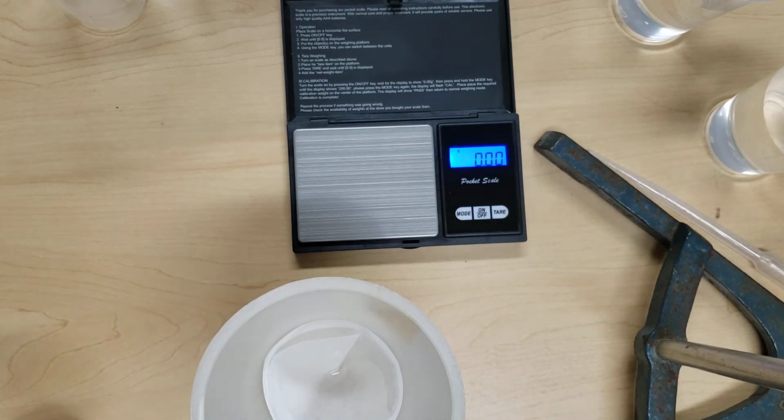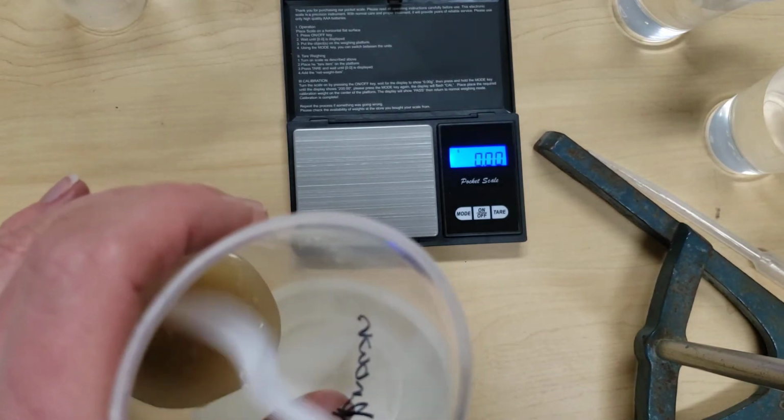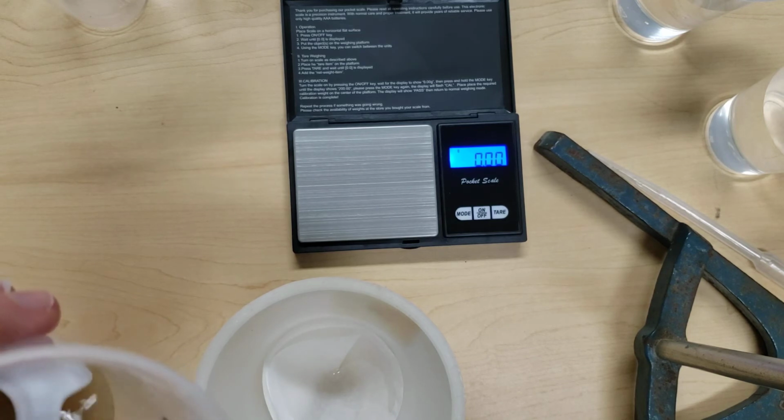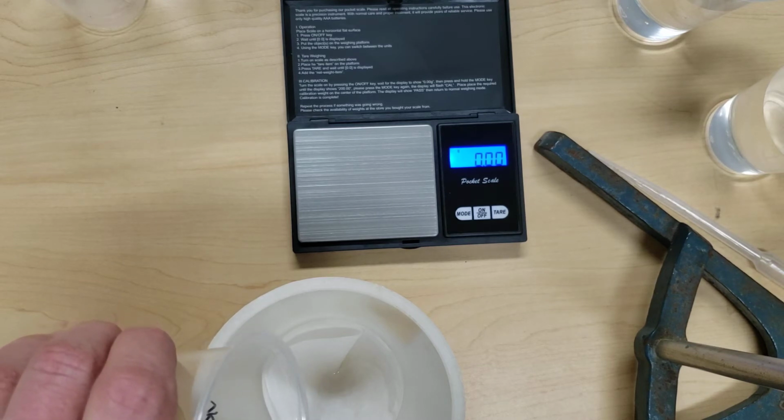Okay. So now what we want to do is take that mixture, the water that you've added to your unknown and mixed for 2 minutes, and filter the liquid away from the solid.